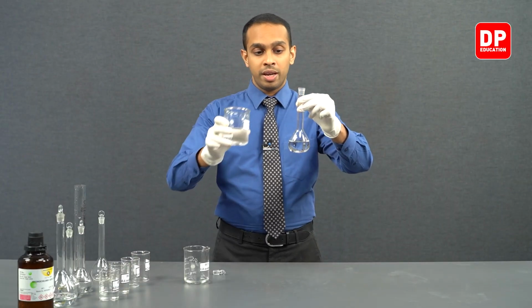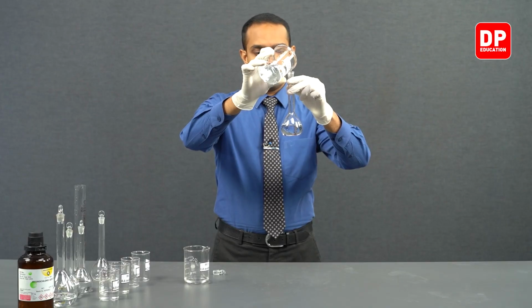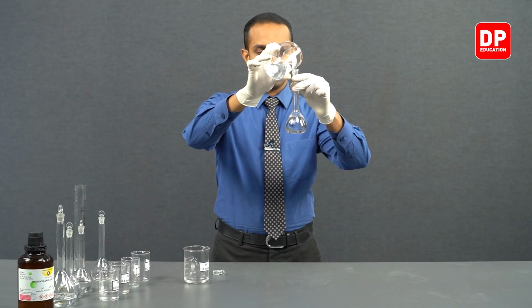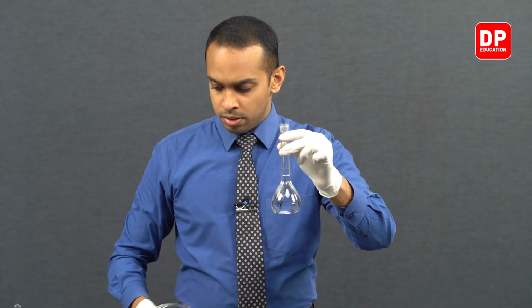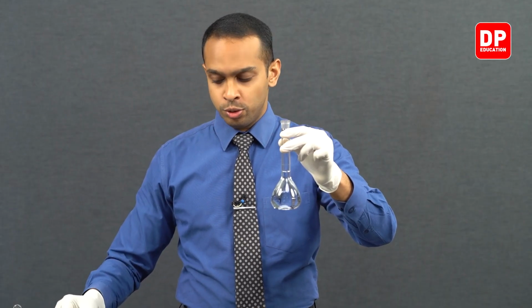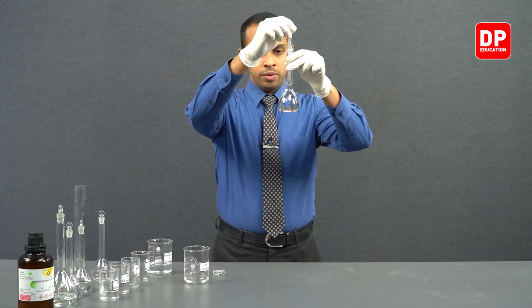Afterwards, we can add distilled water with the use of a beaker to this volumetric flask. As always, the final few drops of the distilled water will be added with the help of a dropper.